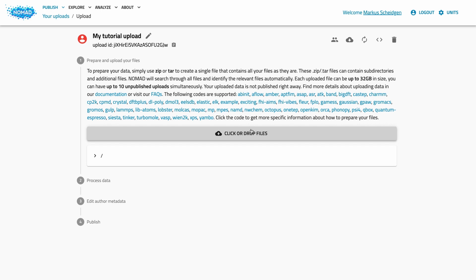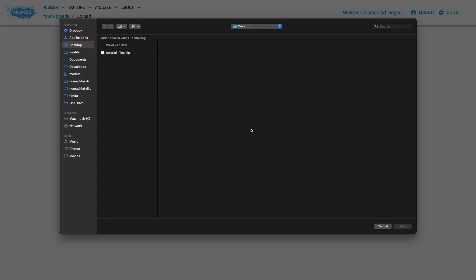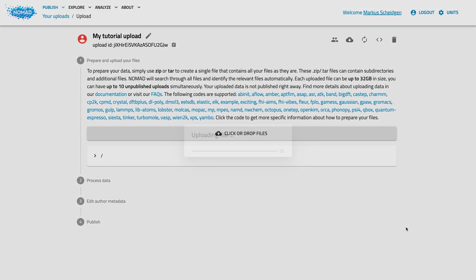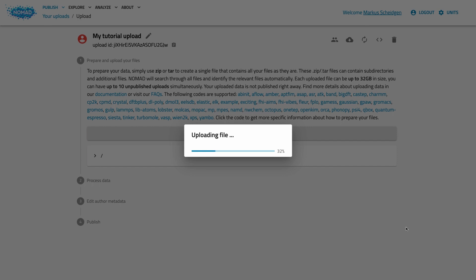Now let's upload some files. In the video description you'll find some example data that you can use, but of course feel encouraged to use your own data. On top of the dropbox you see a list of supported file formats. You can drag files to this box or simply click on it to open the file selection dialog of your browser. You can upload individual files, or if you have a zip or tar.gz file, you can upload a full directory structure in one go. NOMAD will extract all archive files automatically. You can use this repeatedly to successively build your upload. In future NOMAD versions we will expand this functionality and also allow you to delete and move files.